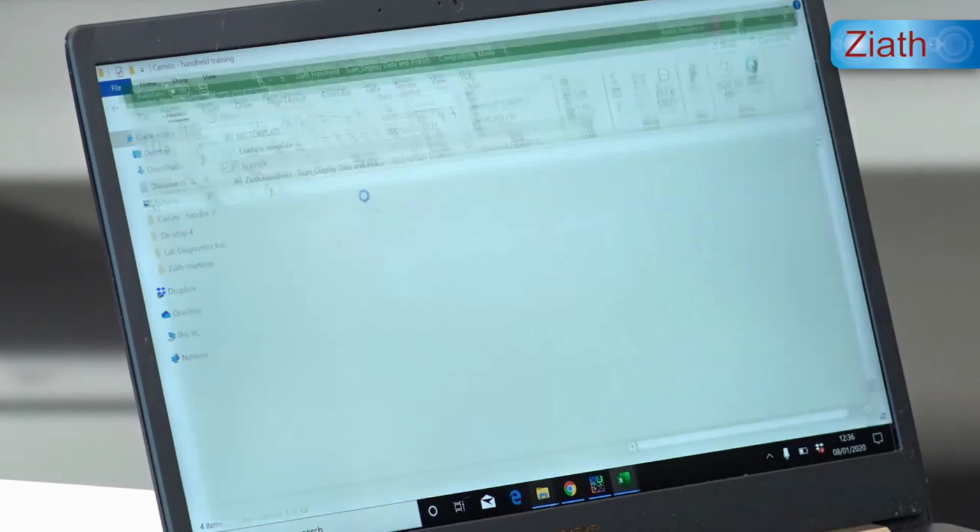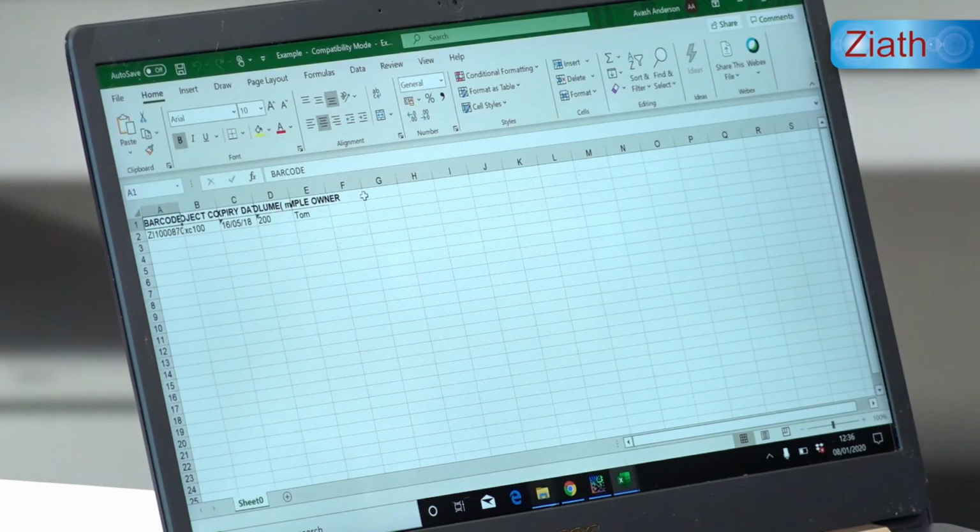which should show one tube that we just added with the handheld and the information that we inputted via the Add and Edit Sample Information is now shown on screen. If multiple tubes were added, it will be shown in a list here.